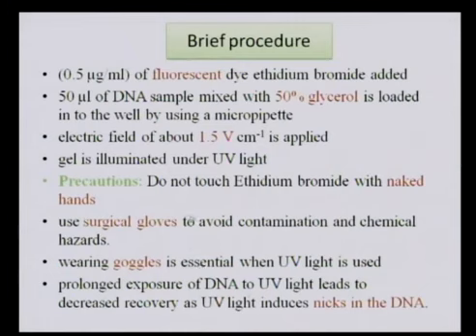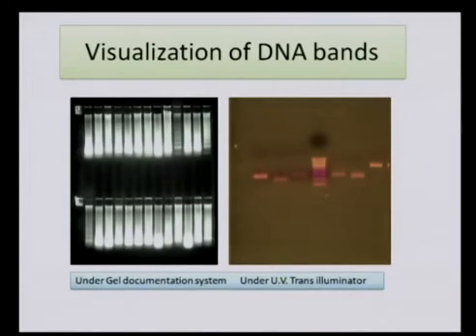So that's why it is always better to avoid touching ethidium bromide with your bare hands, and to wear surgical gloves and goggles to avoid exposure to the chemicals as well as to the UV radiation. So in this slide you can see how the gels of agarose gel electrophoresis appear after separation.